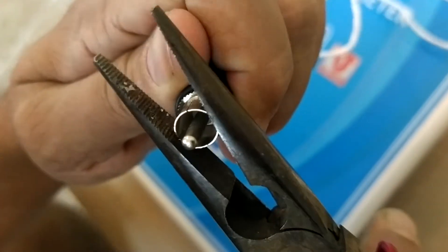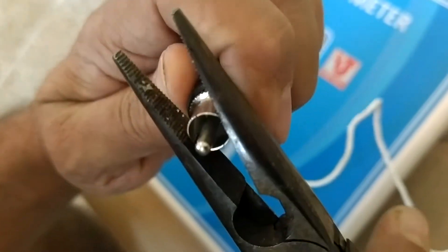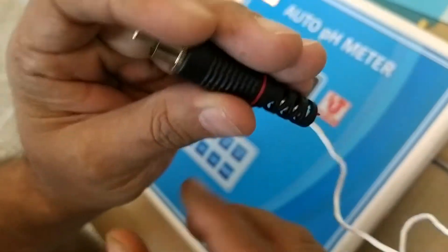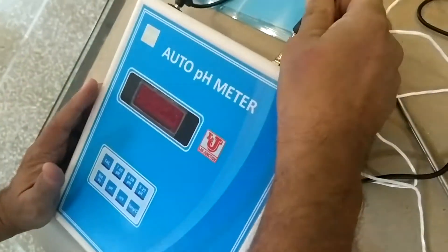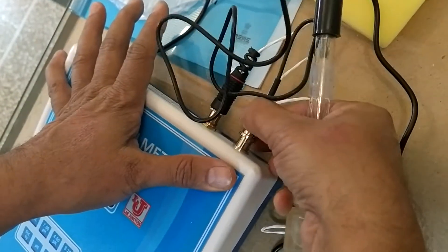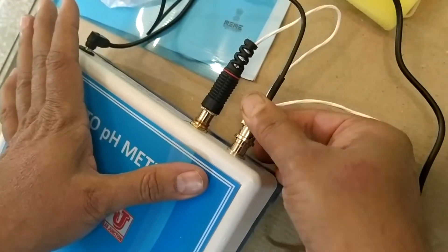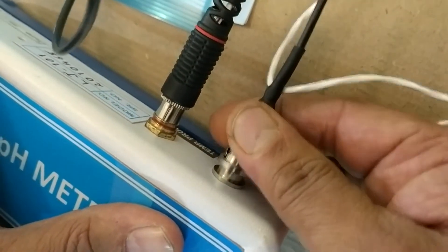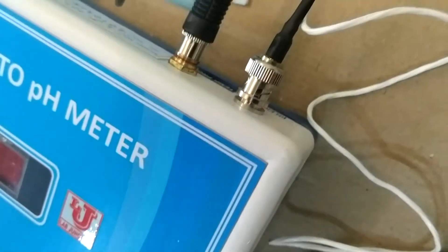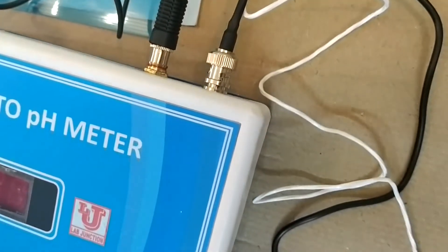Then please slightly close this clamp — slightly closed. In case the auto pH meter does not show accurate temperature as per your ambient temperature, that is the troubleshooting. If it is correct, no issue. You can connect the pH electrode to this — push this way and twist, like your LED lamp in your house. Now switch on the instrument.